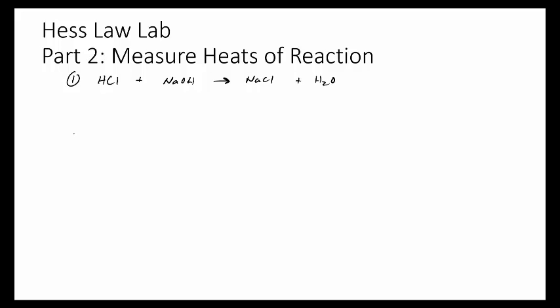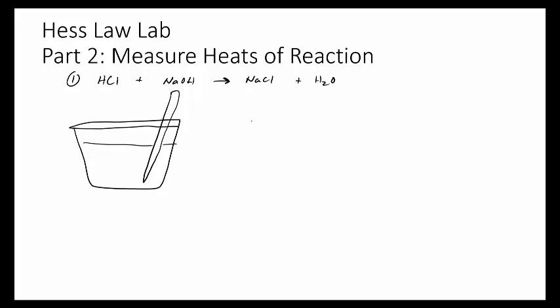Okay, and we'll also be using a coffee cup calorimeter with the thermometer here. For the heat of the reaction, we're going to do this the same way we've been doing these in the past. Since this is an all aqueous environment, this is called the heat of solution that we'll be measuring.